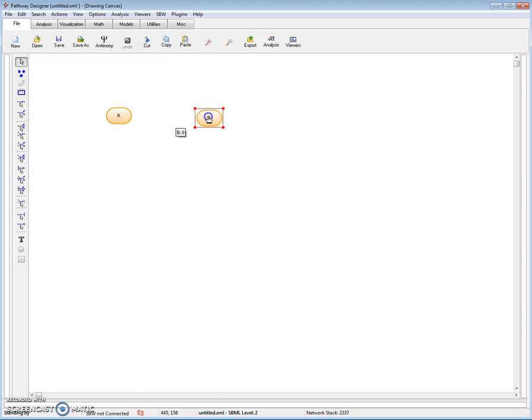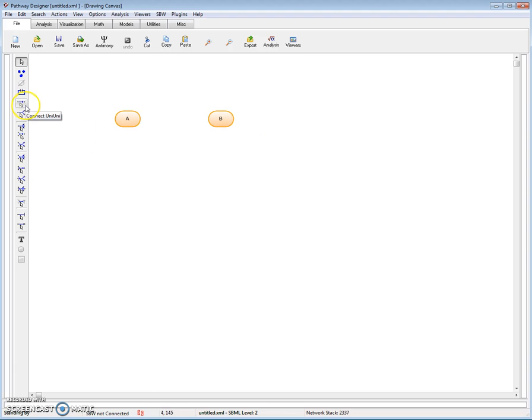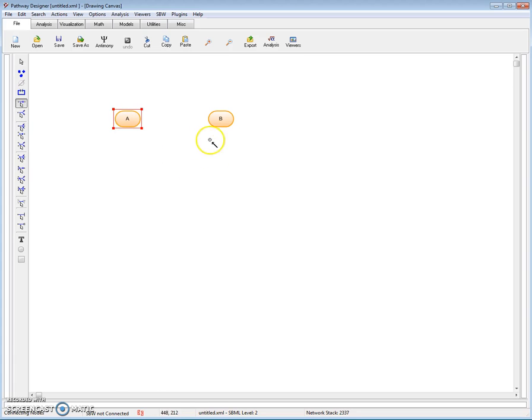I can rearrange things if I like. I can change the position of nodes. The next thing I'll do is join these two species with a reaction. And the reaction I'm going to pick is the Uni Uni. I select that. Select the reactant node. Select the product node. And you can see I have a reaction.